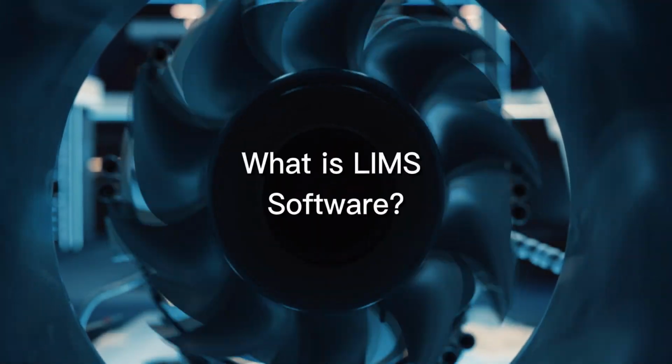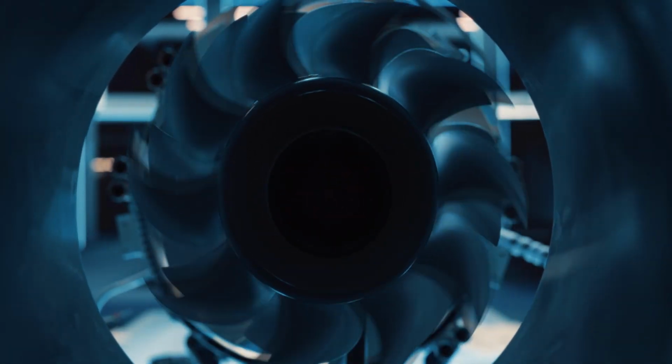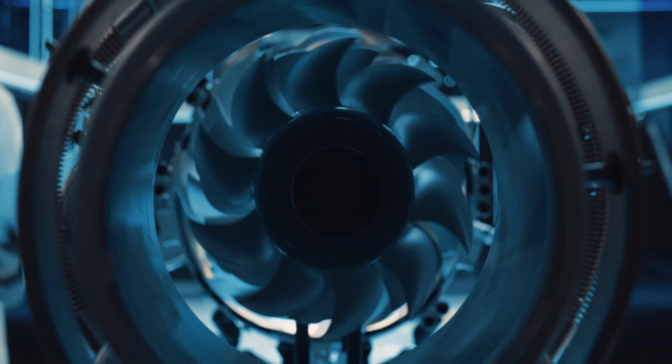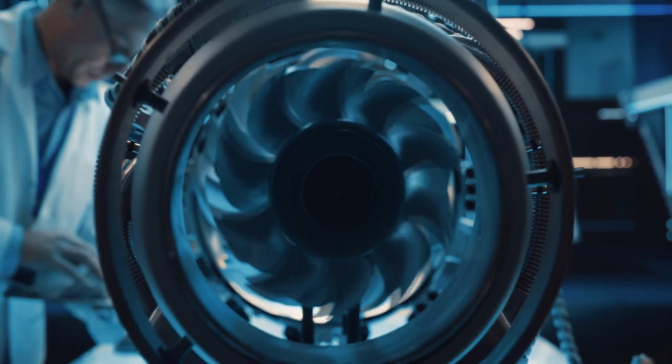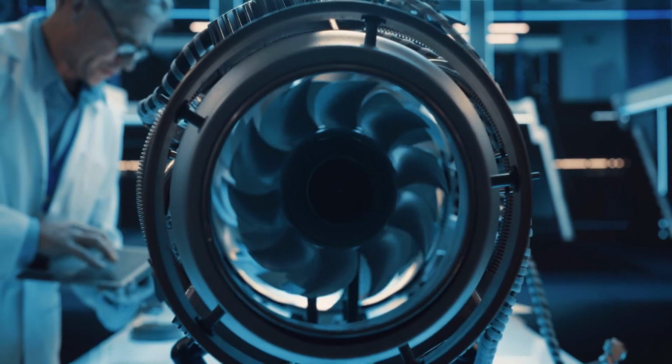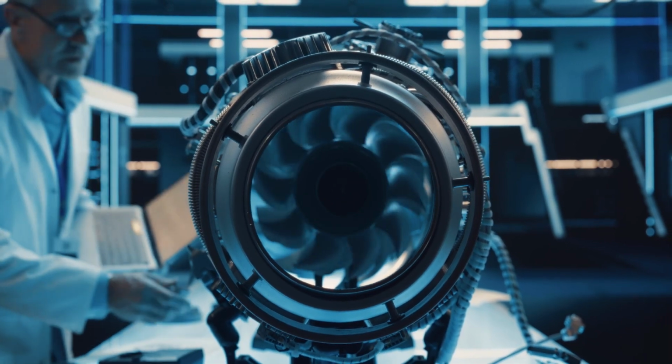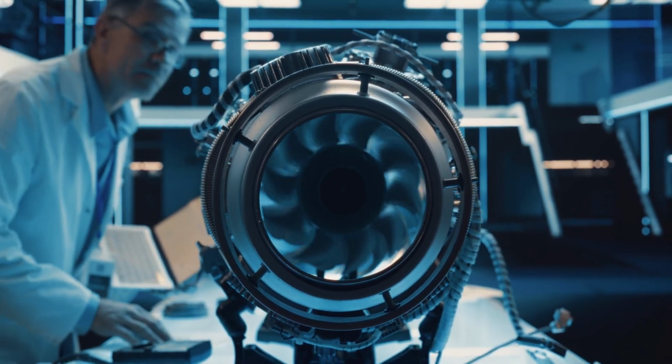What is LIMS software? LIMS software, or Laboratory Information Management System, is a software program that is used to track work in the laboratory and capture results of testing. The features provided by LIMS are dependent upon the provider. However, there are a few features that are common among typical LIMS.